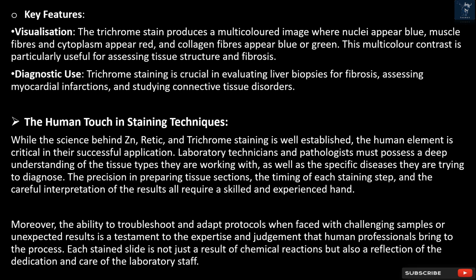The human touch in staining techniques. While the science behind ZN, Retic, and Trichrome staining is well established, the human element is critical in their successful application. Laboratory technicians and pathologists must possess a deep understanding of the tissue types they are working with, as well as the specific diseases they are trying to diagnose.